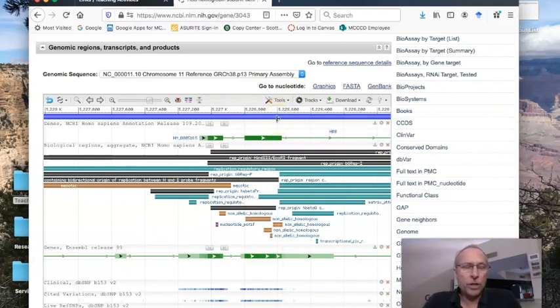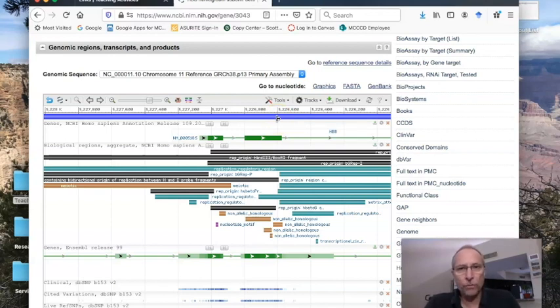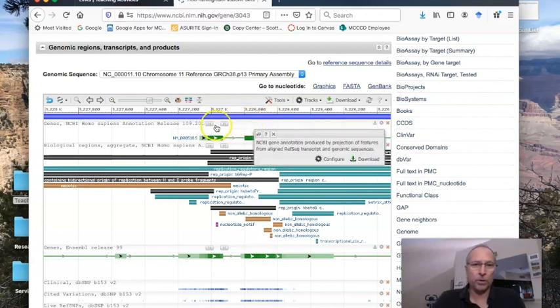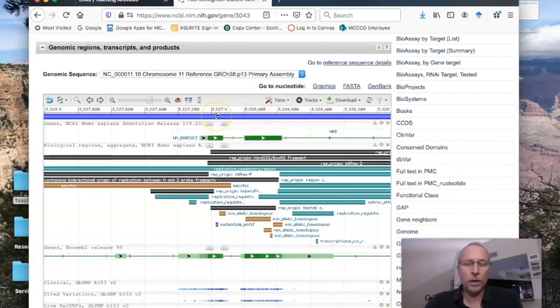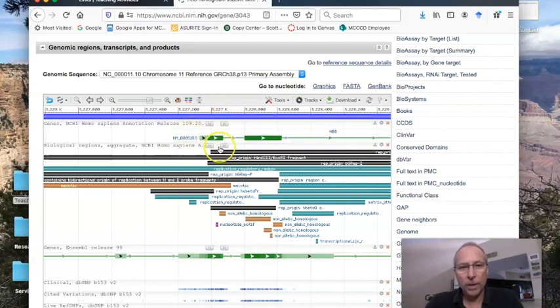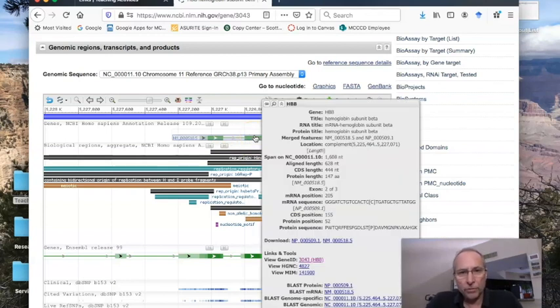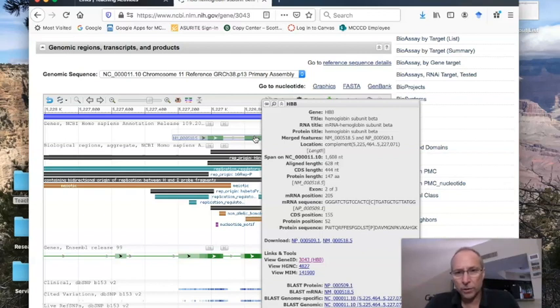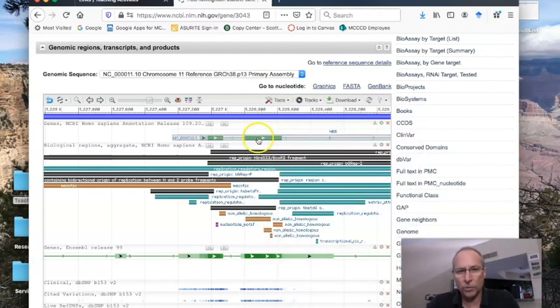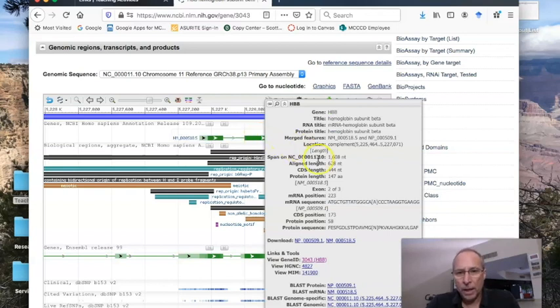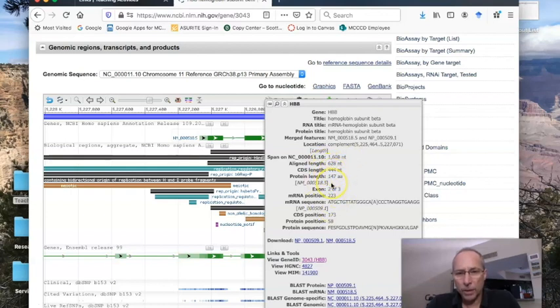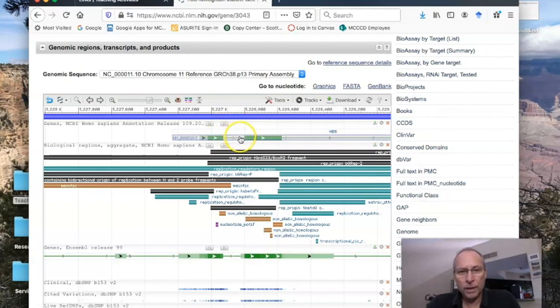I'm going to scroll this over so we can see the beginning part in the middle. You'll notice that there are some parts that are dark green and thick, then light green and thin, then dark green thick, light green thin, and so on. Remember how genes are structured? Eukaryotic genes have introns, sections that are removed before the protein is expressed, and exons are the parts that hold the information about how to build the protein, the actual primary structure. That's what's being shown. The dark regions are the exons, the light thin regions are the introns. This gives you information about the gene.